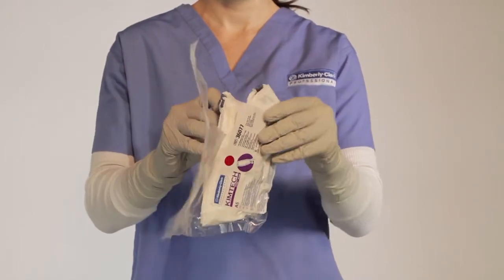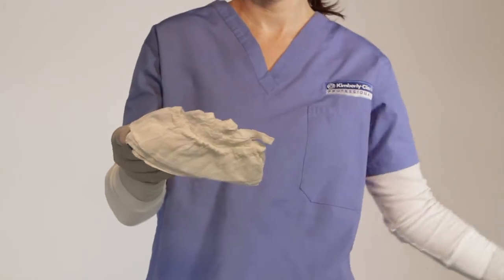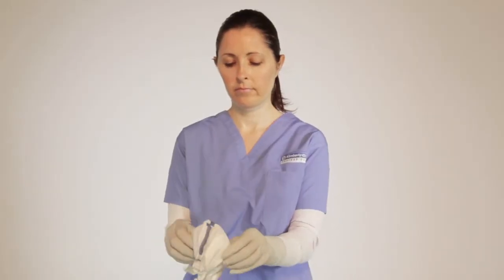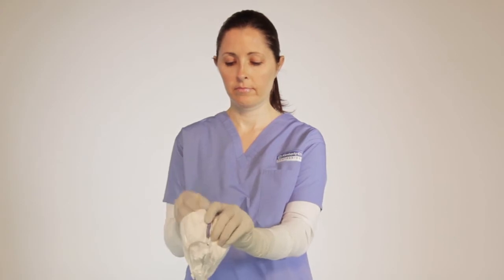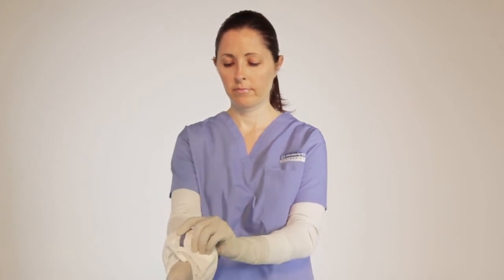Reach in and pull out one sterile sleeve at the cuff. Locate the opening, which is the larger side of the sleeve, and stick your hand through with the thumb loop positioned upward.